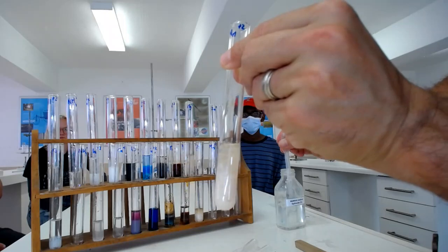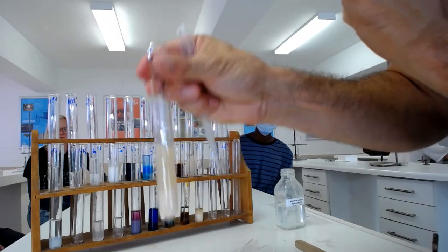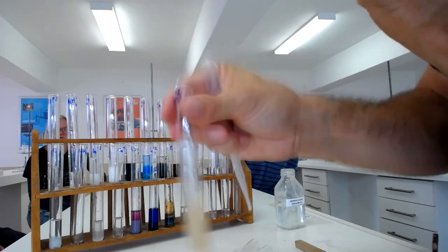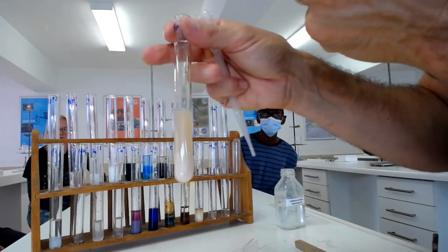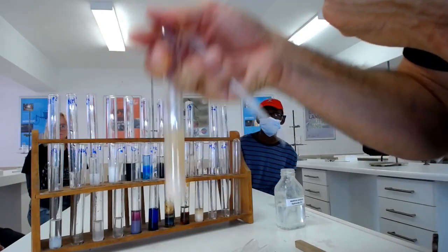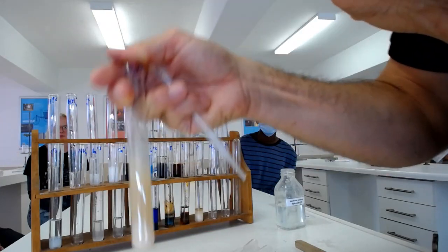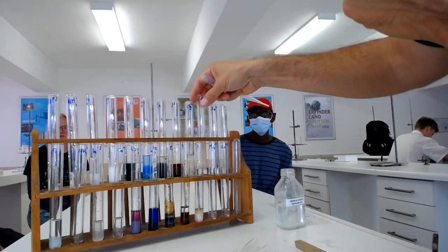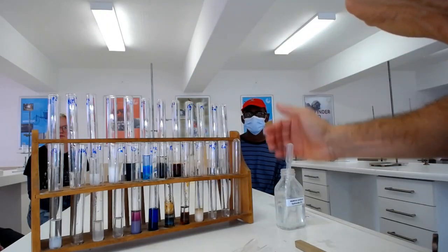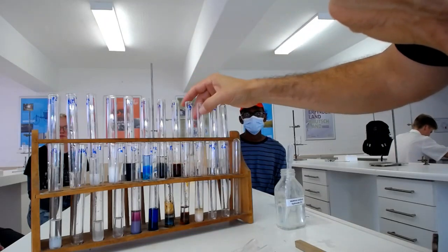I'm going to see if you are right. I think we're just doing manganese twice. No, this is manganese. The other one was magnesium. It's still the same thing. Although magnesium doesn't mention turning brown, manganese does. Oh, magnesium did turn brown. Yeah. That's interesting. Okay, but manganese is not soluble in excess. Yeah. It's not.